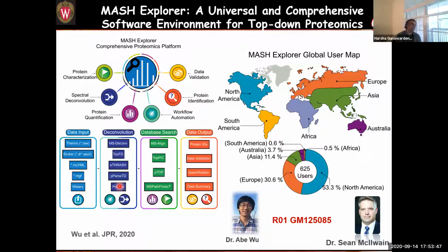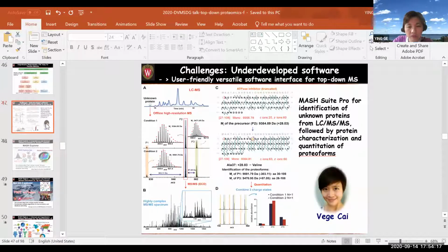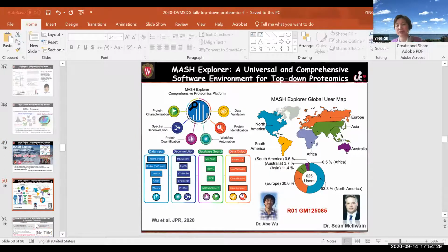Yeah, so in terms of error rates, right? Is there some way we can eliminate some of these things that are biased towards certain features in your data? Yes. Right. Especially if you're looking at drug binding, right? So glycosylation. So this program, of course, has a very nice feature: it's visual, so you can really annotate or validate manually, right? And you can use all these different deconvolution algorithms and compare those results.